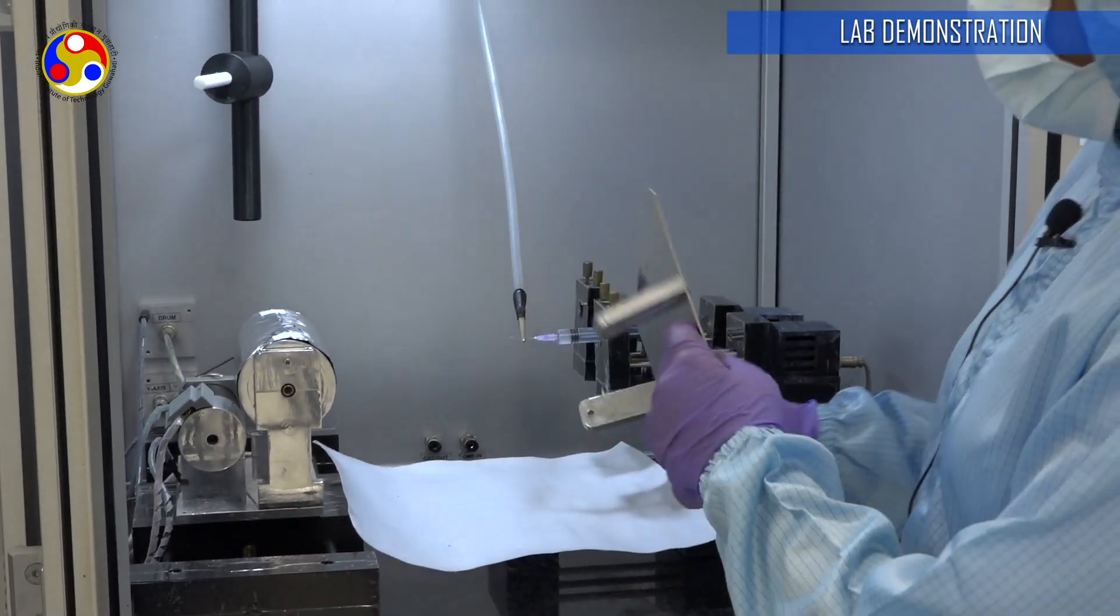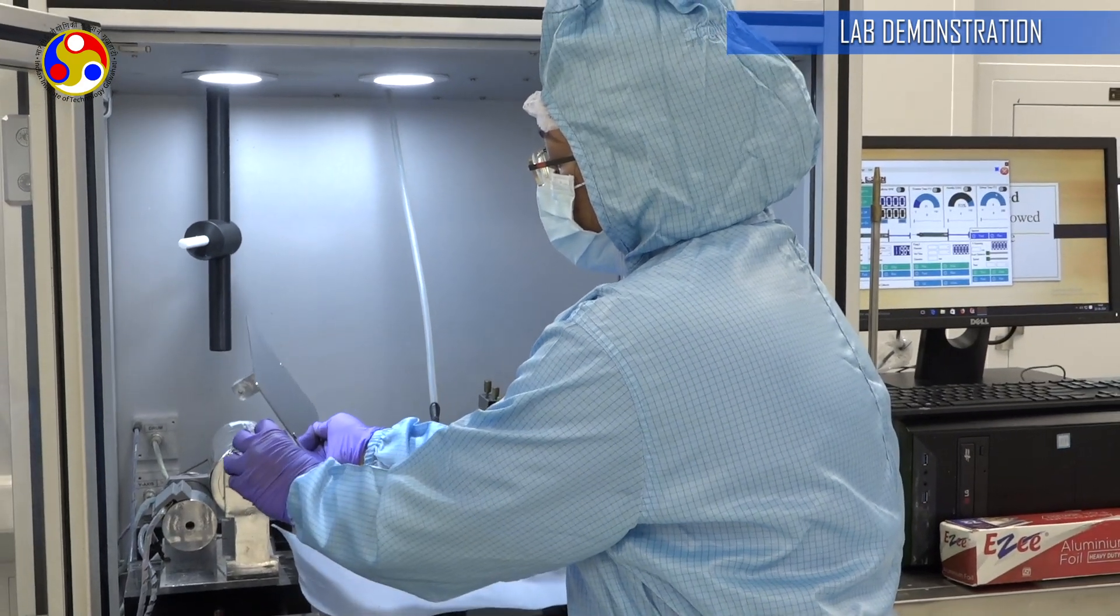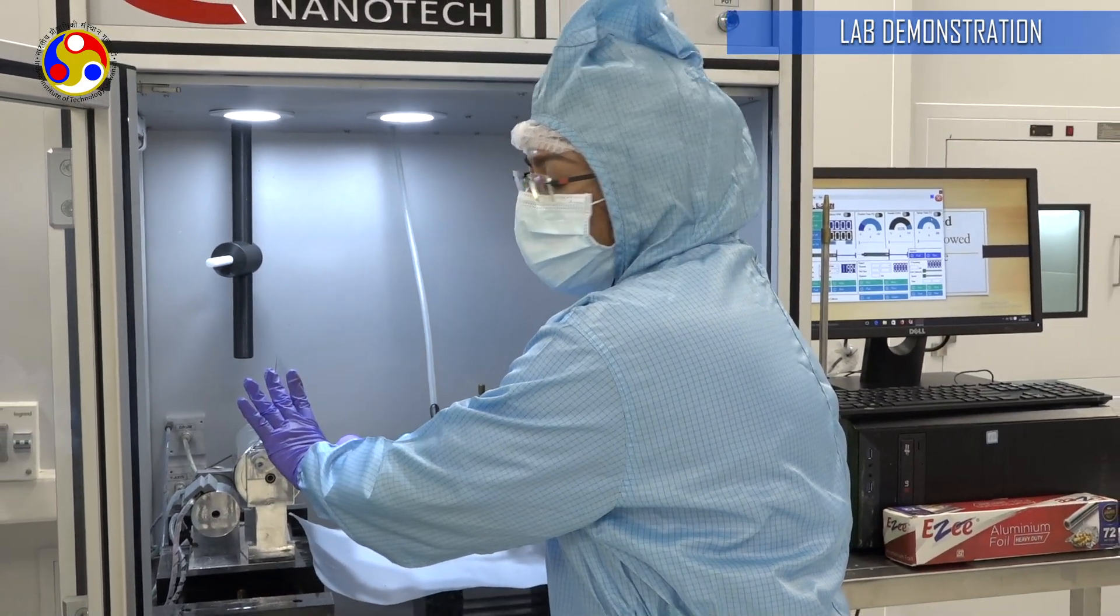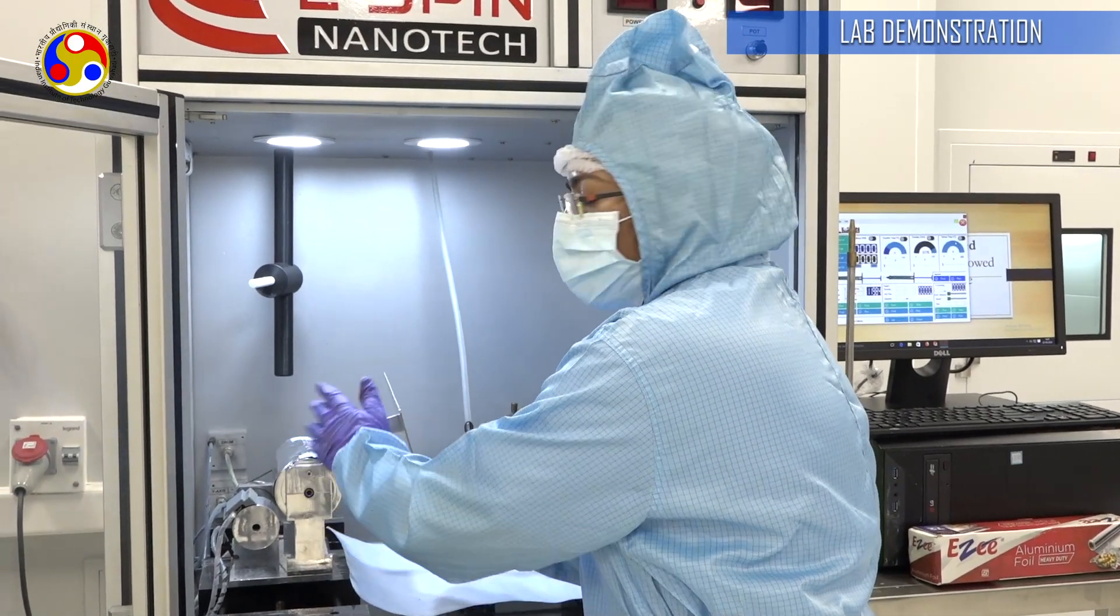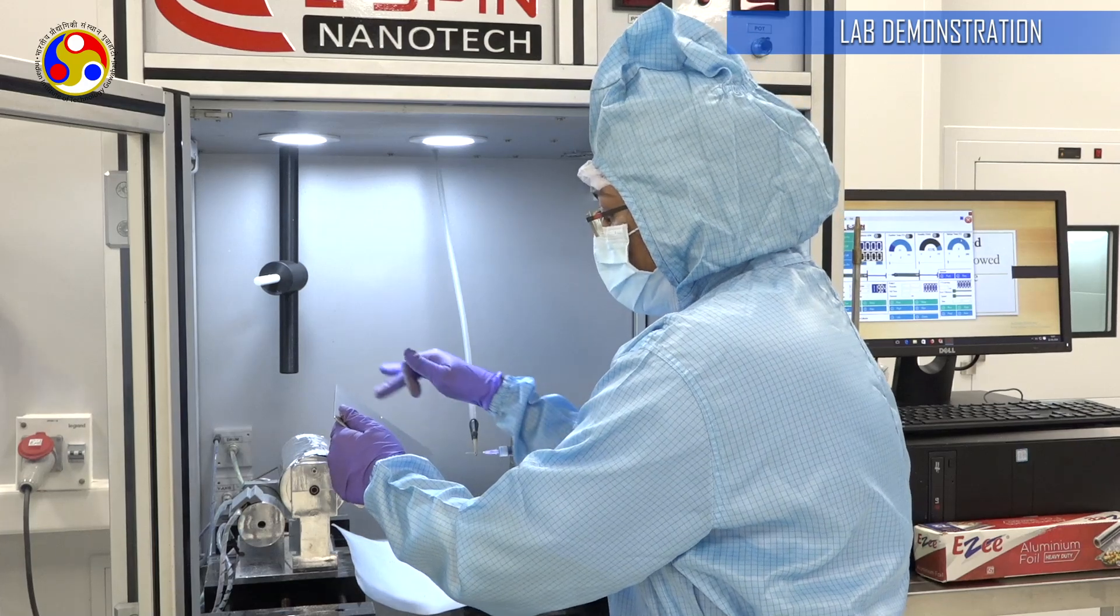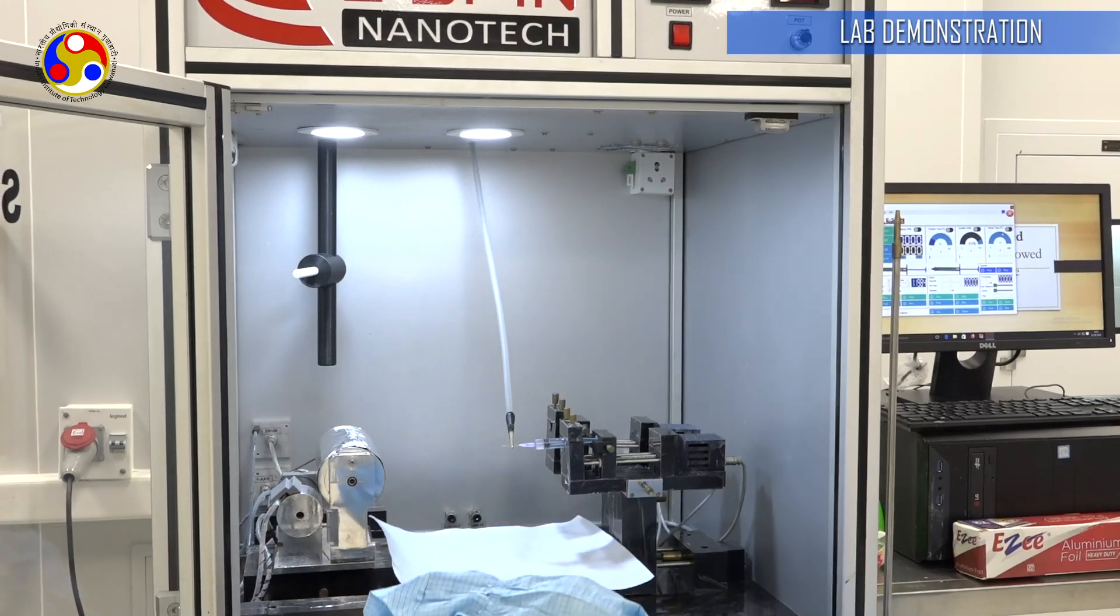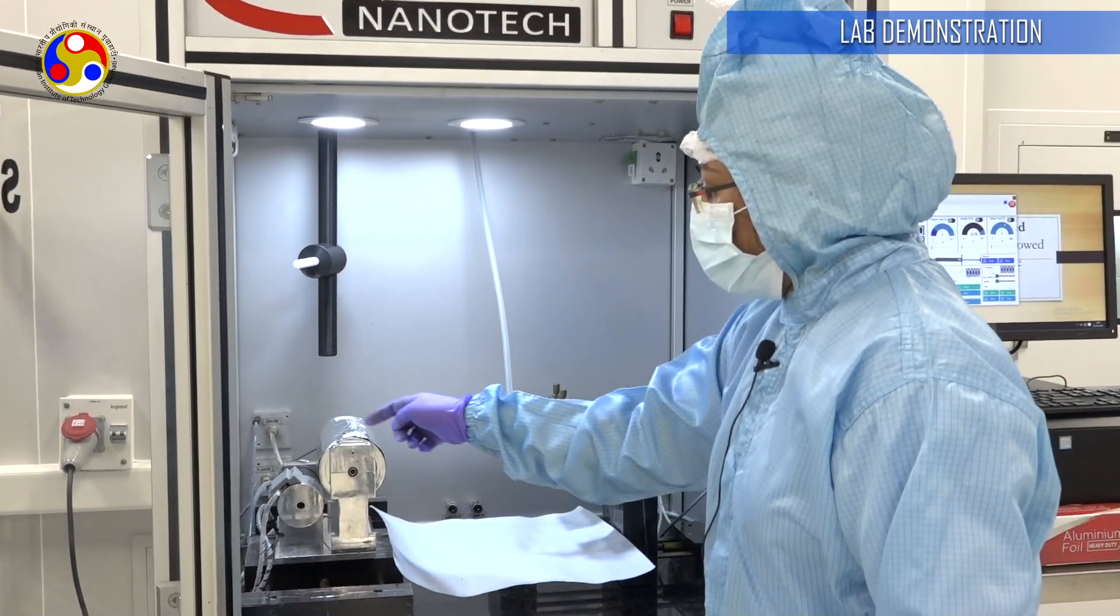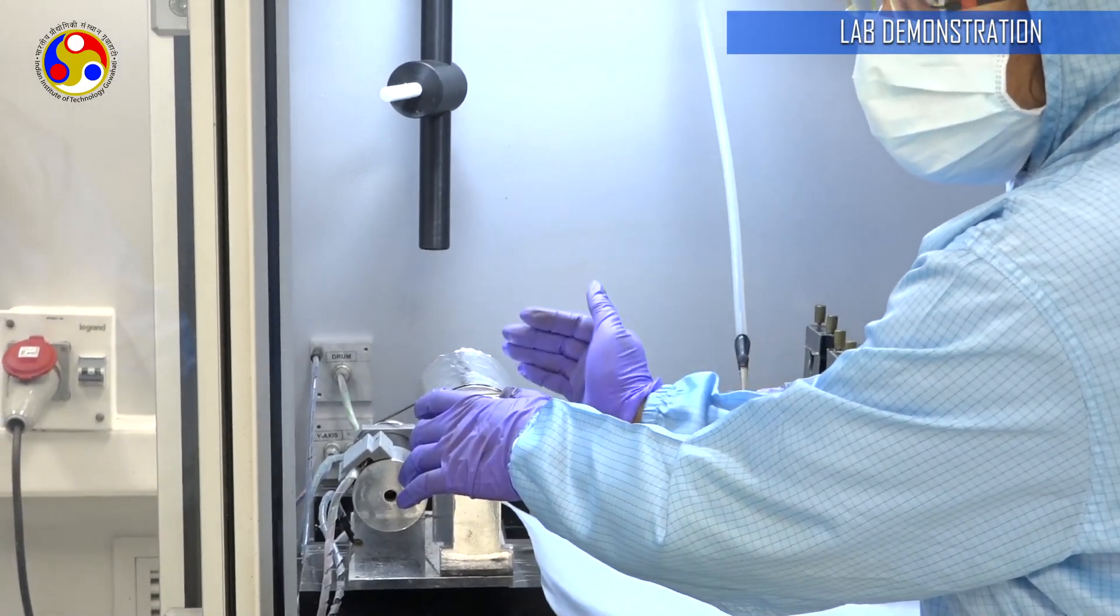This is a plate collector and it can be attached over here like this. This is a stationary collector and you can bend it however you want, but it won't rotate. The fibers will just deposit on the surface like this in loop-like structures. The advantage of the rotating drum collector is that when the fiber deposits on this, it will just move backwards and you can get more aligned straight fibers.